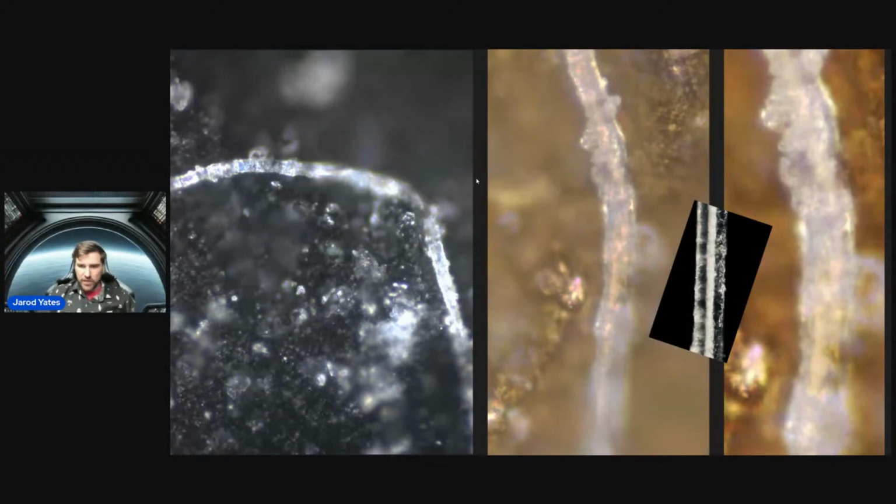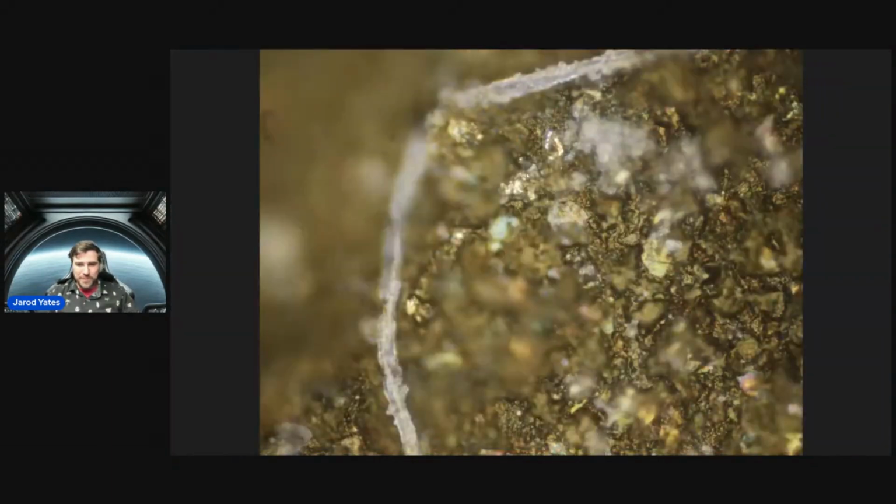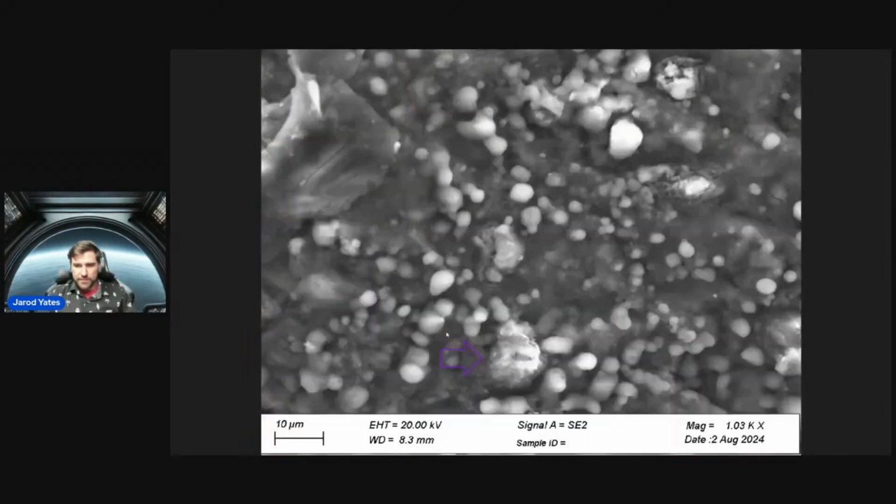Coming up in November, I'm going to be visiting the lab, and we're going to try to hopefully do some live streaming of the sample under the metallurgical microscope. So maybe I'll just pluck one of the gray whisker hairs that studying this sample has given me, and I'll put that on the scope. We'll do some comparison. Here's one last image of that weird fiber going on under there. Now, there could be, you know, cooler explanations, like it could be a fiber optic cable or something, but I strongly doubt that. It's probably more likely a contaminant, I would suspect.